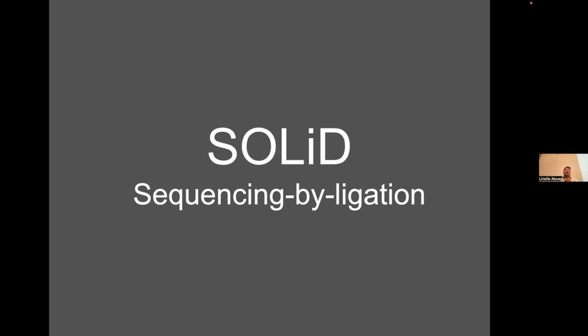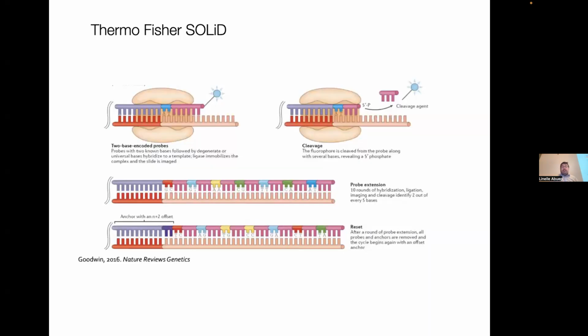Now, SOLiD, another dead technology, and this one I'm sure is dead, because I'm pretty sure I was the last one when I was at Duke. It's sequencing by ligation. And what they claim is, you're going to see how it works, it was the most accurate sequencer out there, even more accurate than Illumina. And the way they did it was pretty clever. Now, instead of doing synthesis, meaning you incorporate and you measure the incorporation by light or dye, this time you're going to ligate a complementary sequence to it.